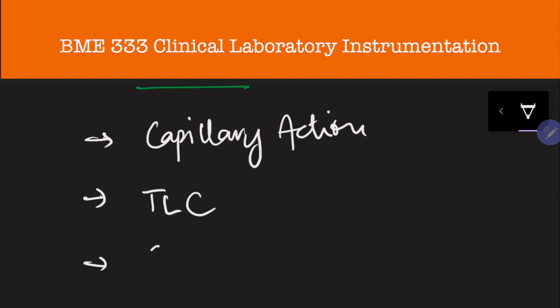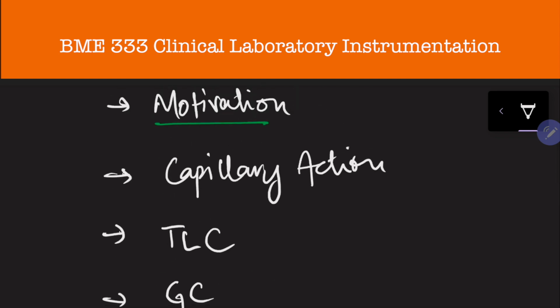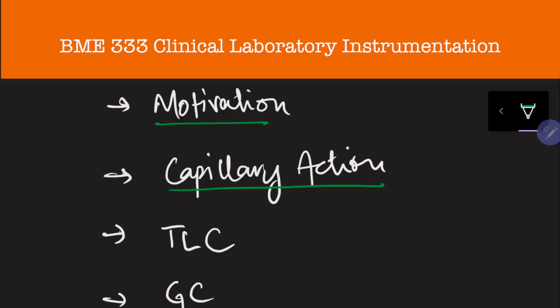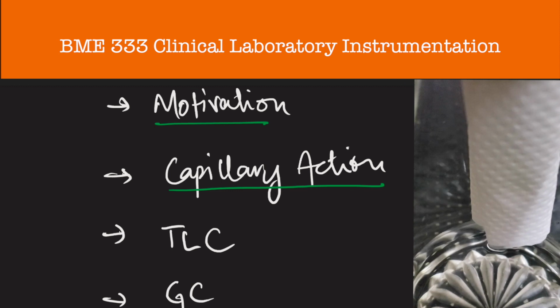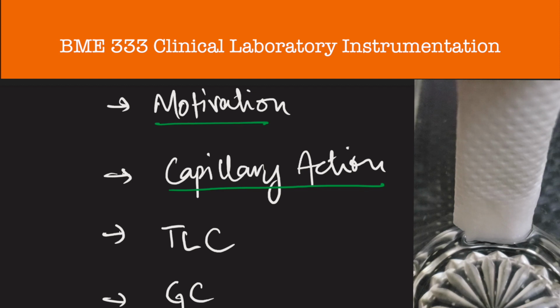Before we get to that, we'll see a quick demonstration of a video, which should appear on your right hand side now. Yes, there it is. It should basically show capillary action at play. All right. What we see here is a prime example of capillary action, which is basically just the ascension, the sucking up, or the travel of liquids through a tube or cylinder or permeable substance. In our case, it's just a tissue. It could also be seen in a straw.